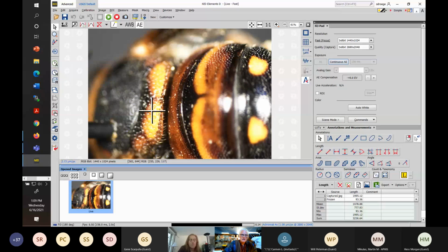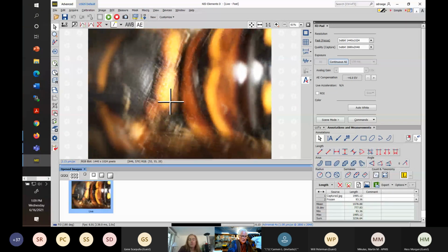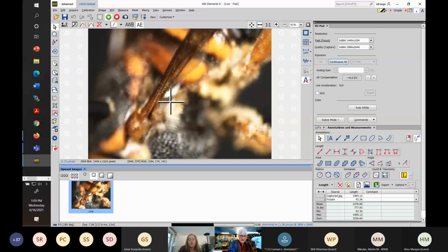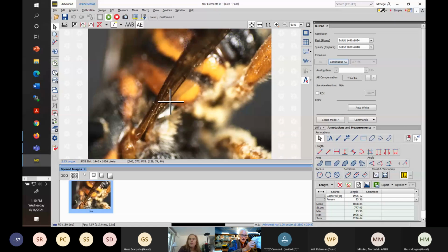In this particular case, the scutellum is projecting out and has this very thin area, and you can't really even see the propodeum and other features back there. If we change the angle, you'll see it again. It's very pronounced, but if you haven't seen it before, you start second guessing your looks at Anthidium sometimes.